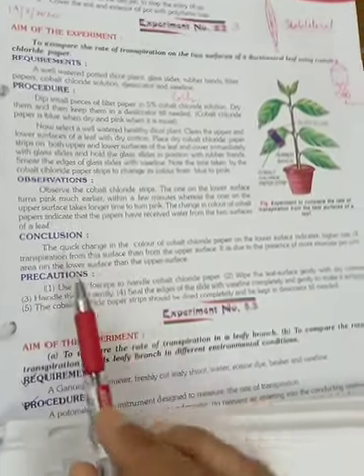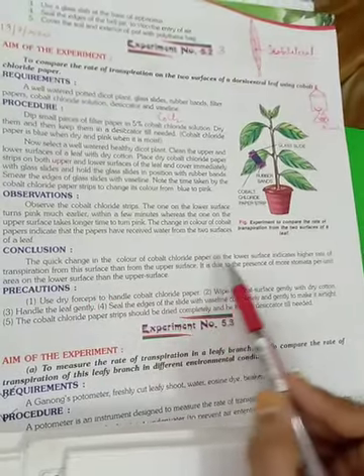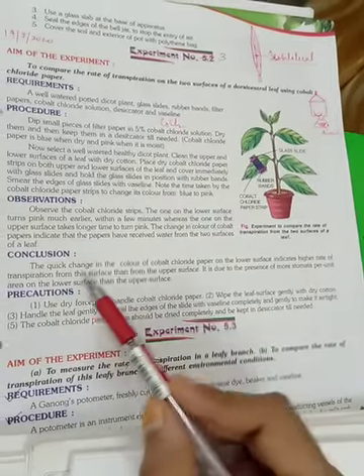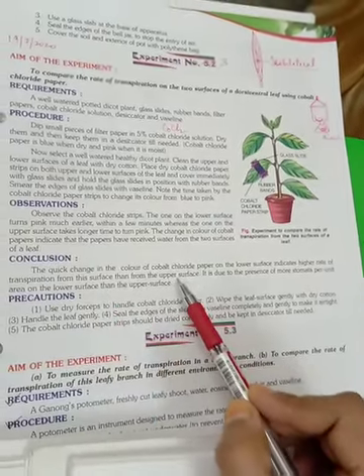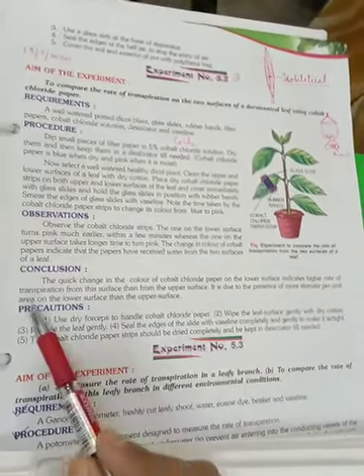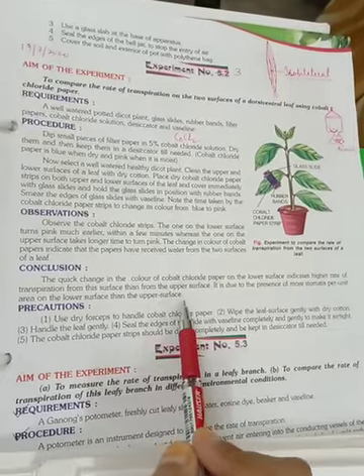Conclusion. The quick change in the color of cobalt chloride paper on the lower surface indicates a higher rate of transpiration from this surface than from the upper surface. It is due to the presence of more stomata per unit area on the lower surface than the upper surface.